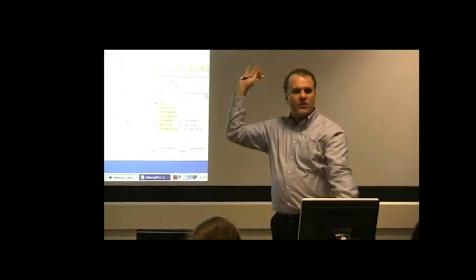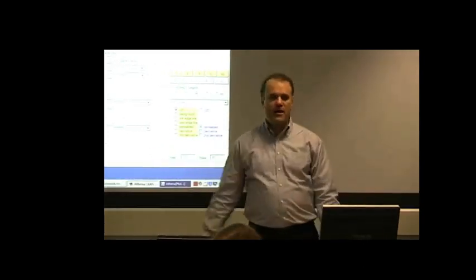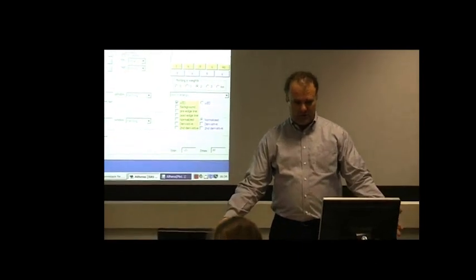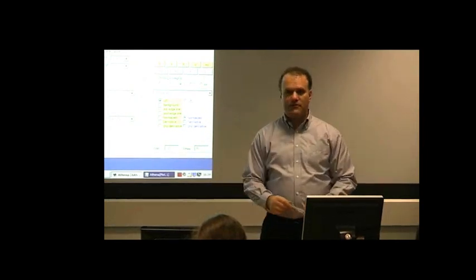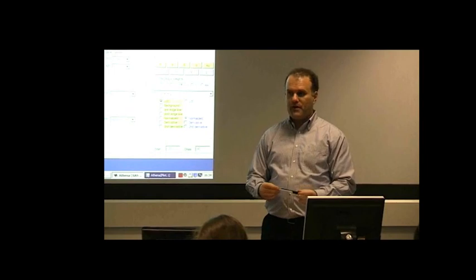So this is just about the end of this presentation. What I would suggest for those of you who are coming to Athena for the first time is take either some of your own data or some of the example data that I provide and just play around with the software.